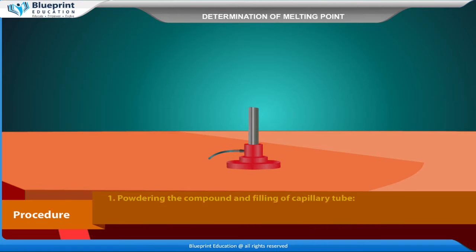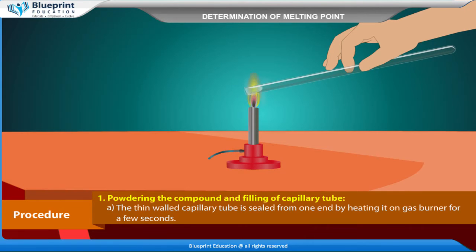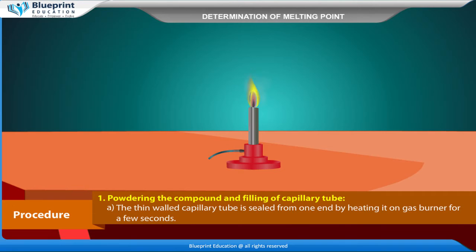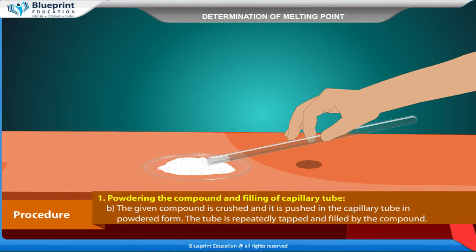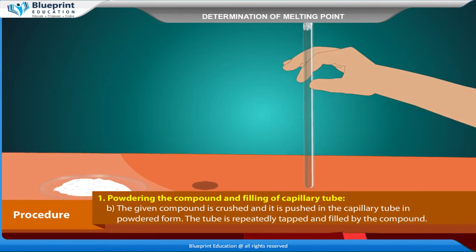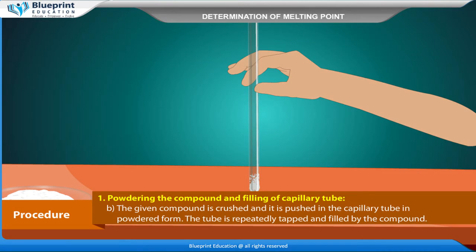Procedure — Powdering the compound and filling the capillary tube: The thin-walled capillary tube is sealed from one end by heating it on a gas burner for a few seconds. The given compound is crushed and pushed into the capillary tube in powdered form. The tube is repeatedly tapped and filled with the compound.